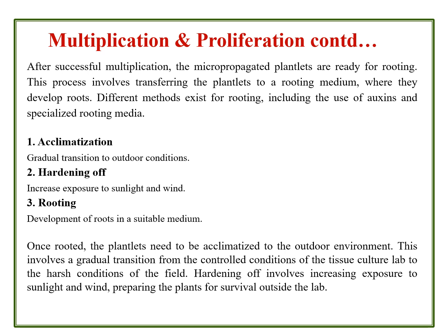So once they are acclimatized to the greenhouse chamber culture conditions, it is the right moment to transfer them to the outdoor conditions, since they must be acclimatized to the ordinary or field conditions. And then the next step in the proliferation is the hardening stage. So increased and frequent exposure of the plantlets to sunlight and wind to withstand the ordinary conditions.